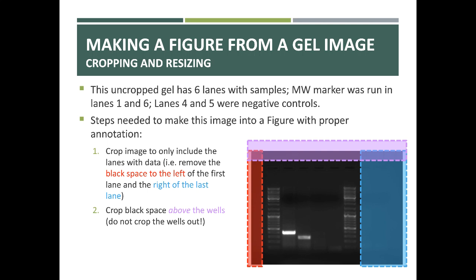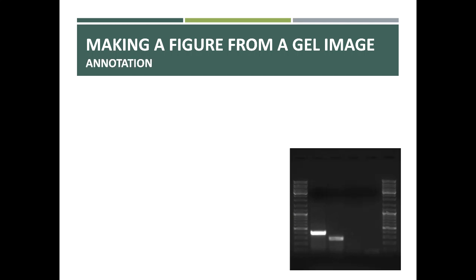started in the gel. You can resize the image from a corner, but never stretch it from side to side. Depending on which program you have, just make sure that when you're enlarging your image, that you're not distorting it. It needs to enlarge in an equal way. So after you've done the cropping, this might be what that figure looks like.